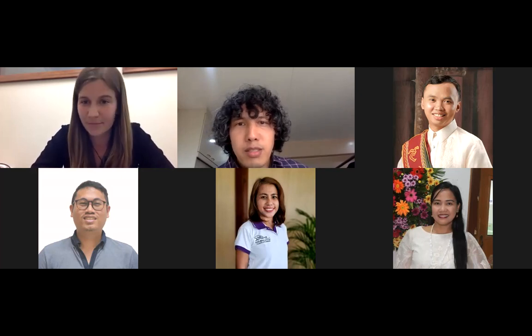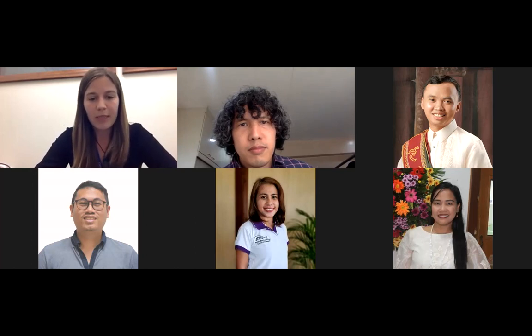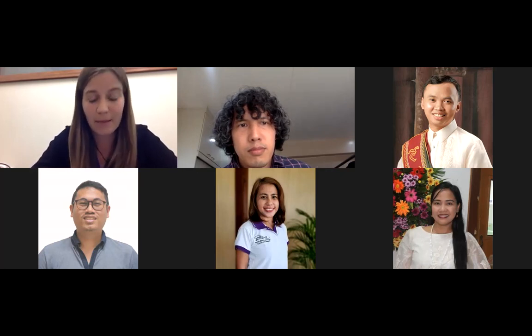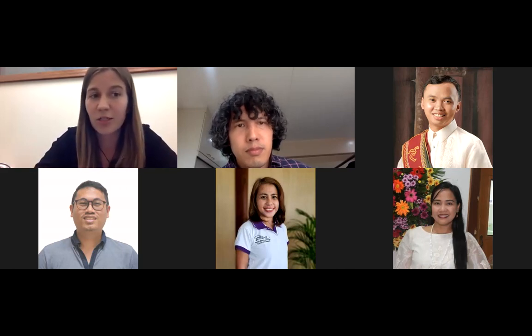The next question here is if you have plans to explore bacteriomics as well. So not specifically just viromics. We are, as said, doing shotgun sequencing at the moment, with which we should discover viruses as well, obviously. It will be interesting to see how much you can really discover with shotgun sequencing with respect to viruses and fungi and eukaryotes, and how it is more helpful than 16S, also with respect to finding functional genes and so on.